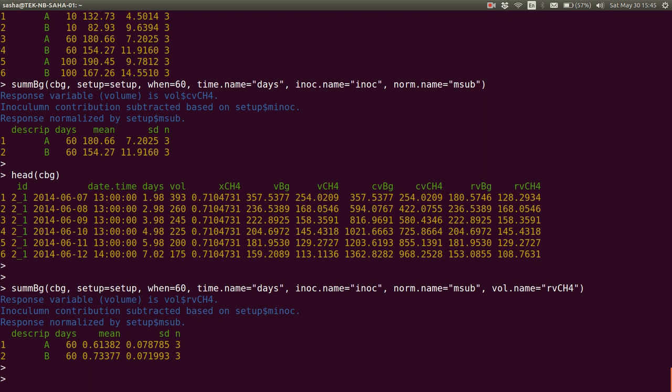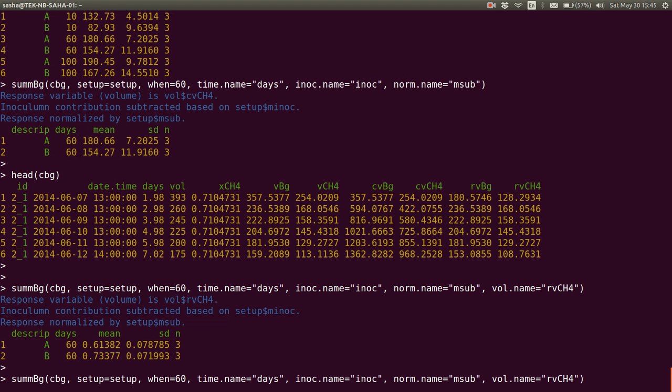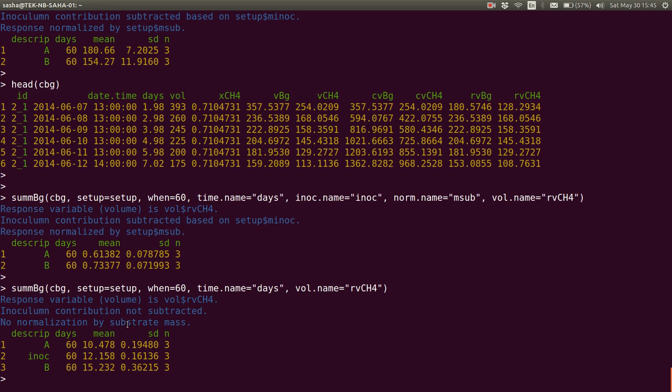Now, it may not make sense to try to normalize that for a particular point in time, so let's just look at the actual rate at a particular time. Well, there are the mean rates, milliliters per day, because cumulative production is in milliliters. Our rates are milliliters per day, also because our time is in days.